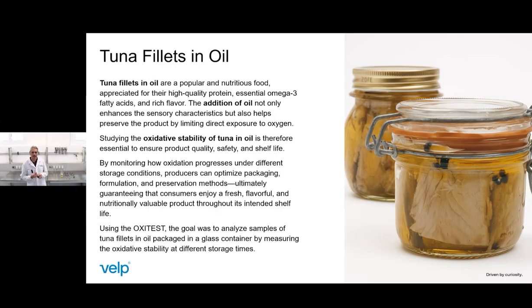During 2015, oxidation studies were performed on tuna fillet oils. Tuna fillets are appreciated for highly quality protein, essential omega-3 fatty acid, and rich flavor. The addition of oil has two main functions: to enhance the sensory characteristic of the product and to help preserve the product by limiting direct exposure to oxygen, reducing oxidation over time.